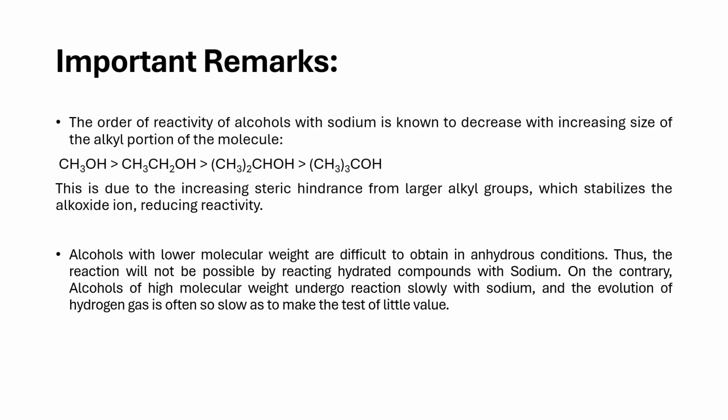And in addition, alcohols with high molecular weight react slowly with sodium, and the evolution of hydrogen gas will be slow. This may be caused by the steric hindrance of the large number of carbon atoms attached to the hydroxyl group, thus making the reaction very slow and of low value.